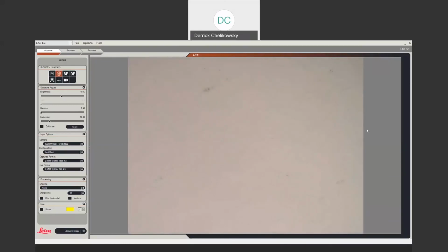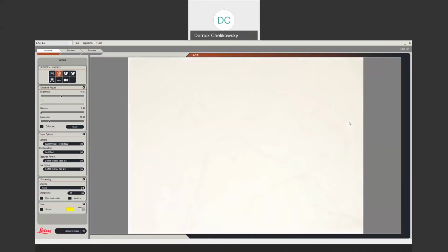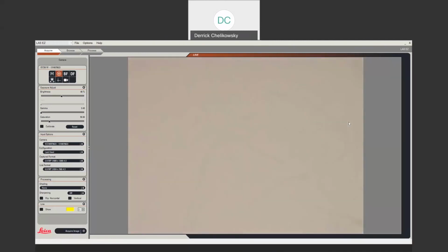And the biggest thing you should need to know about some of these cyanobacteria is that they are poisonous. Well, toxic. There are things known as cyanotoxins. Cyanotoxins are a mix of hepatotoxins, neurotoxins, some rather nasty things. And the ones we're looking at today are filamentous. So these are the filaments right here.